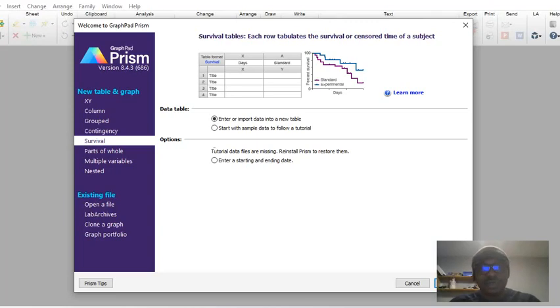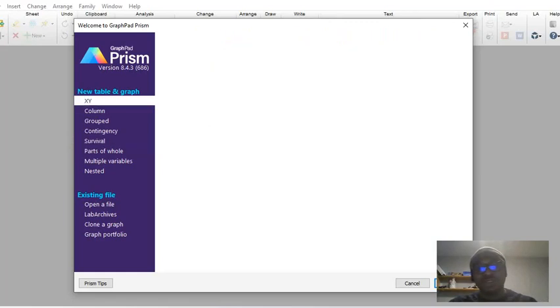But for this, we are going to look at your normality test, testing the data through a normality test and running a linear regression to see if our data is linear, and then possibly plotting a graph. So join me. This is a simple GraphPad Prism version 8.43. So we have everything open on our desktop. For the linear graph, if you want to run the linear graph, you have the x and y.